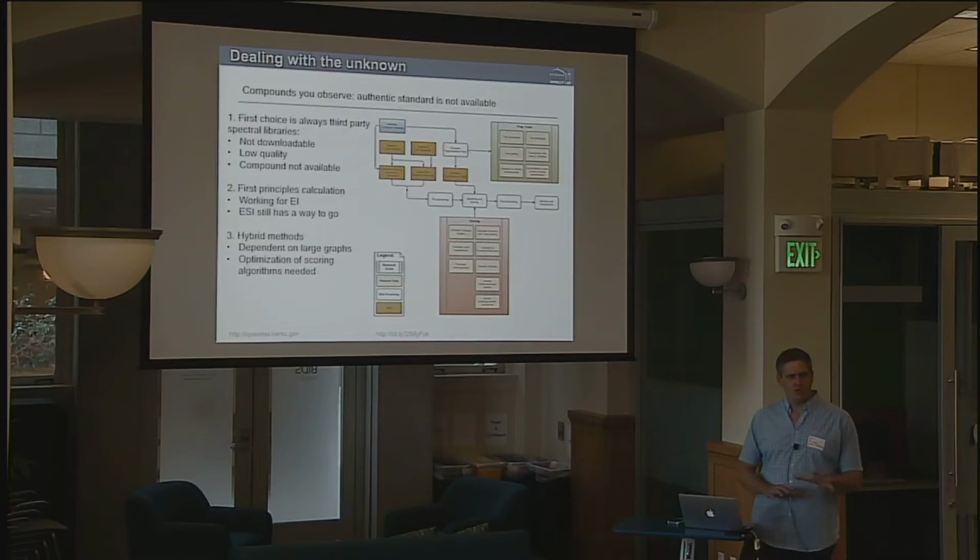So now that we store all this information about all these features, we hope to have a hackathon here at the BIDS Institute. We hope to build a learning process so that when new files are uploaded, the user immediately gets all the benefit of these assertions that have been stored by the previous scientists, the good ones at least. And it doesn't require this careful curation.